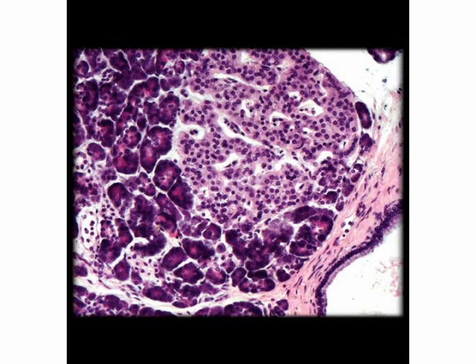Here you see another slide preparation of the pancreas, and on this one, the pancreatic islet or islet of Langerhans is very, very apparent. That's the large cluster that you see whose cells stain a little bit lighter. This one right here. That's the pancreatic islet. All these other little clusters, those are the digestive enzyme secreting clusters of cells. So those would be exocrine.